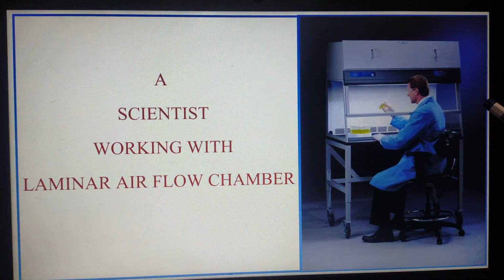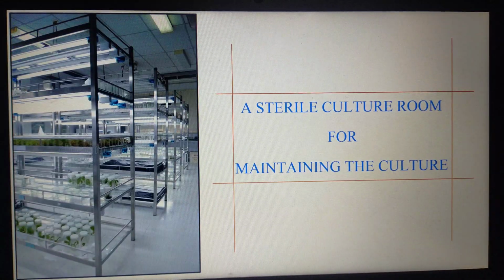You can see in this picture a person using the laminar airflow chamber, right? This is how people sit and make use of this laminar airflow chamber.